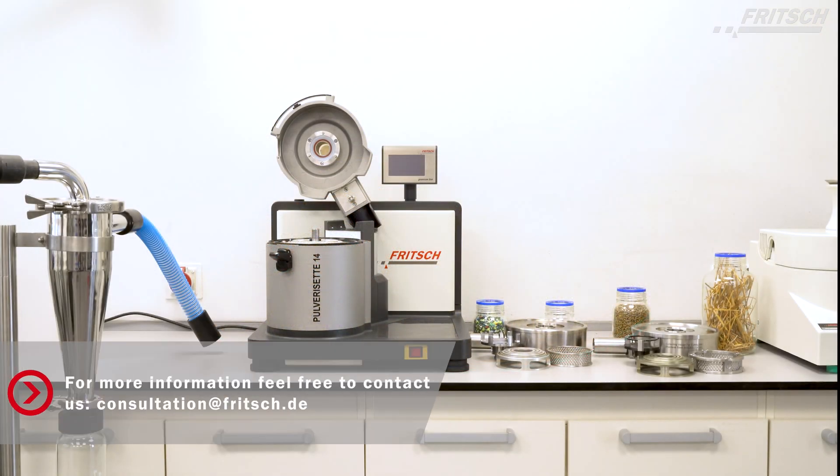The FRITSCH PULVERISETTE 14 Premium Line. For each application, a perfect solution.